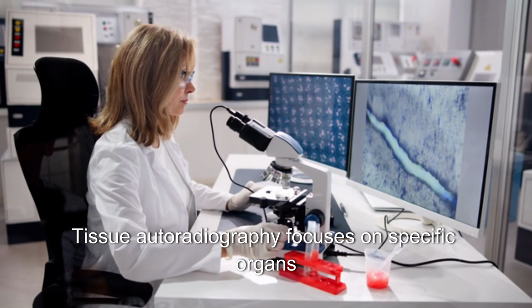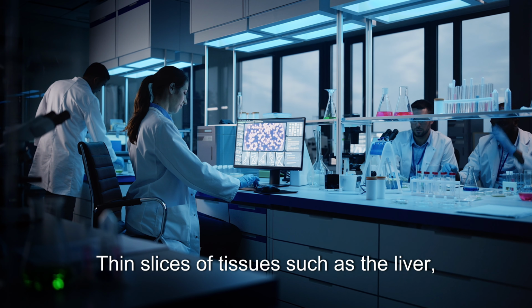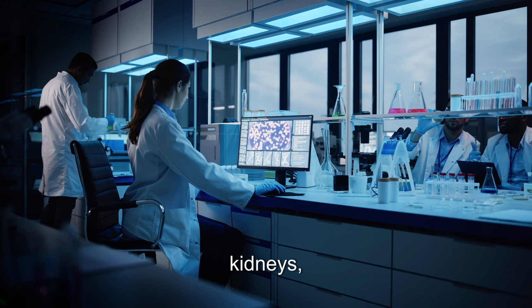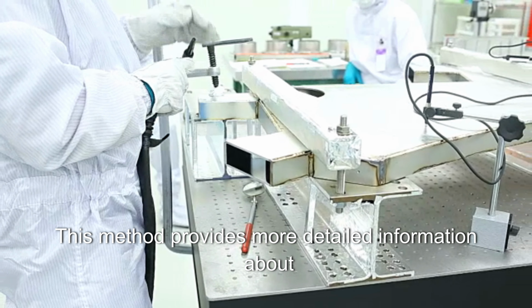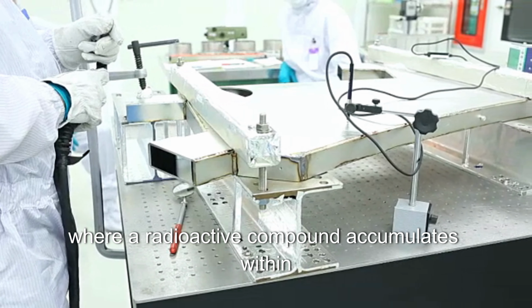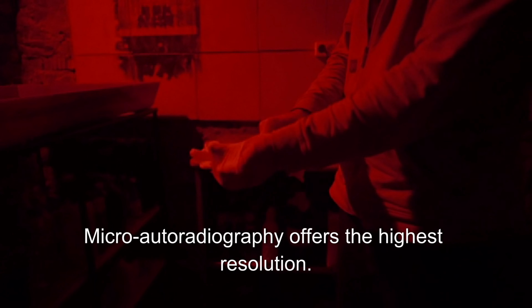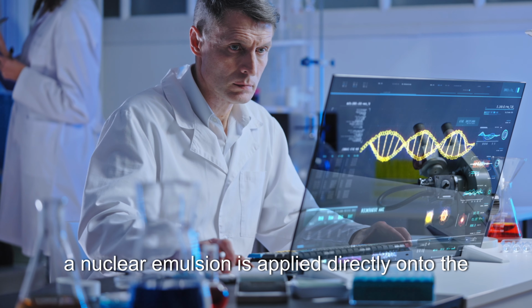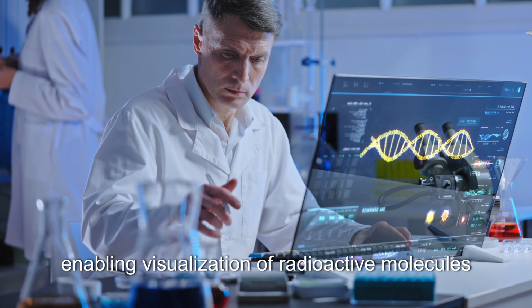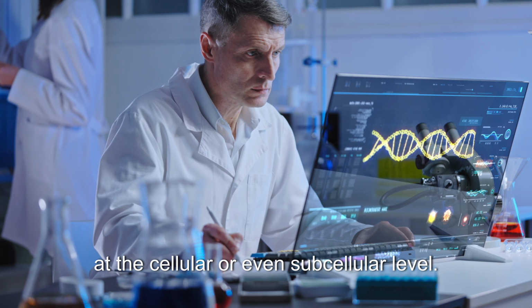body. Tissue autoradiography focuses on specific organs or tissue sections. Thin slices of tissues such as the liver, kidneys, or brain are prepared and exposed to film. This method provides more detailed information about where a radioactive compound accumulates within a particular organ. Micro-autoradiography offers the highest resolution. In this technique, a nuclear emulsion is applied directly onto the tissue section, enabling visualization of radioactive molecules at the cellular or even subcellular level.